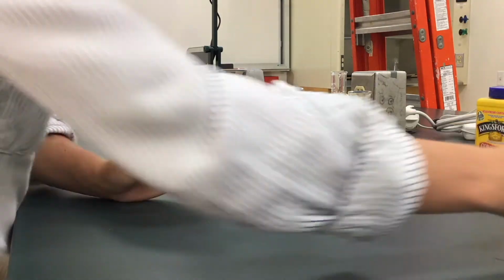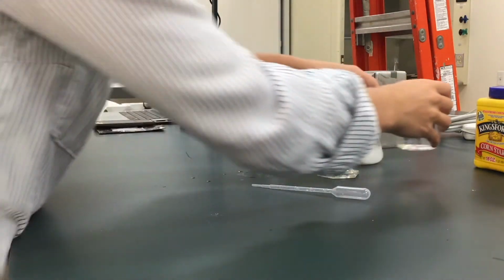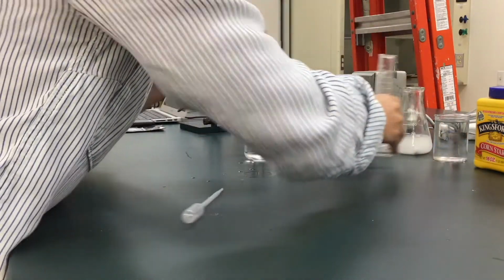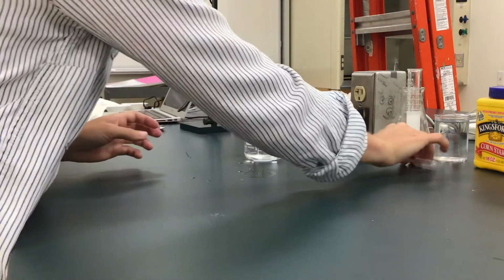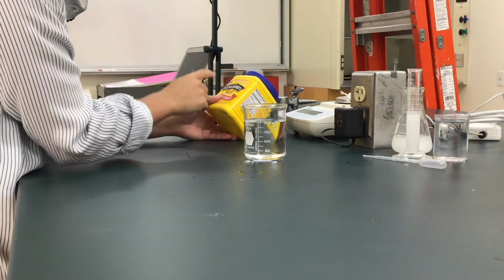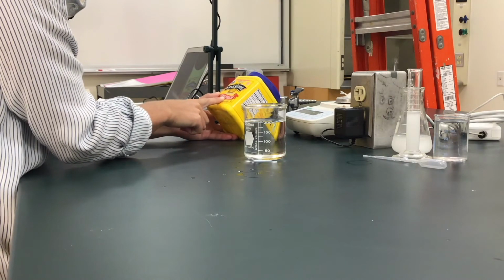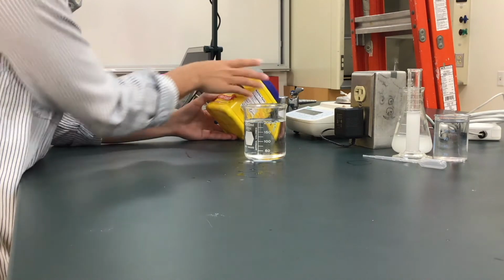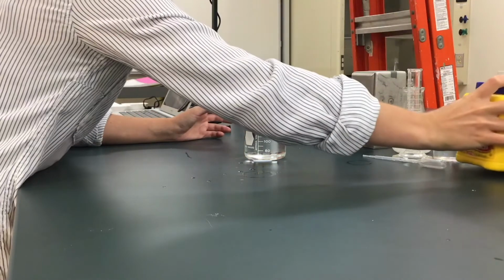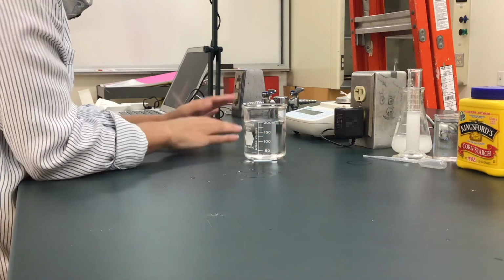The last thing I need to prepare is a volume of distilled water with a way to measure starch. So we need to be able to measure the starch. Remember, we didn't do that in the last step. We didn't measure the starch concentration inside the bag, even though we know we put about 0.9 grams per 75 milliliters into the volume. But we want to make sure that we are measuring starch in both parts of the lab.